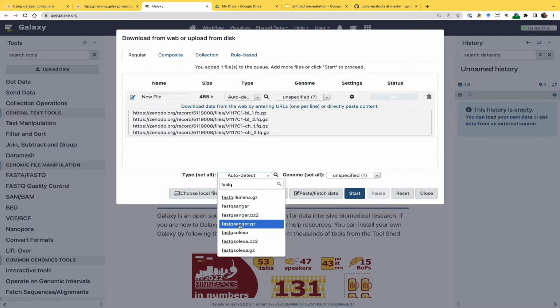Can I ask a question? How would you know? Does that mean this is Sanger sequencing data? No. I assume this is Illumina data. So it is Illumina data. So you find that out by asking. If you have the data produced in the past 5 years, it's undoubtedly going to be FASTQ Sanger data.